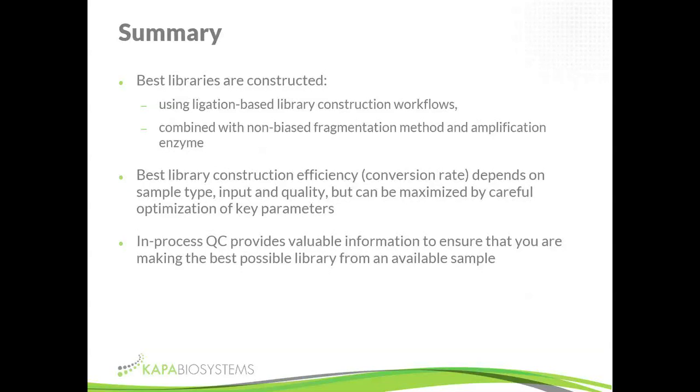And it also gives you a tool to find out whether the problem is up to the point of ligation or whether it's with the amplification reaction. But it's not something that you would do consistently, every time you make a library. Once you have your protocol in place and you know how to benchmark it, then you would just basically QC at the beginning and QC at the end. When all of that's within specifications, you just carry on happily, making the best possible libraries you can.